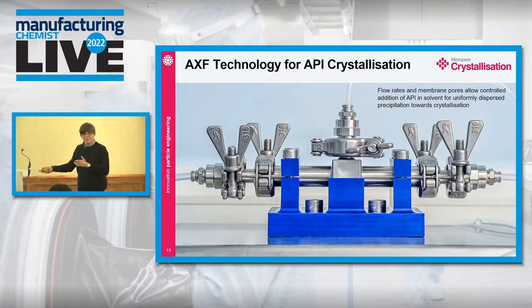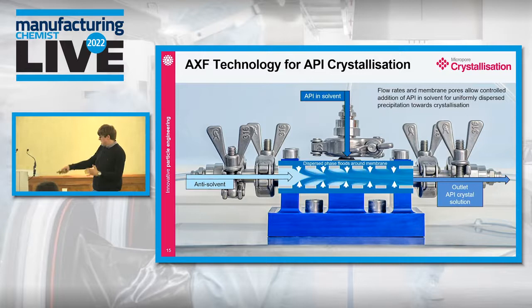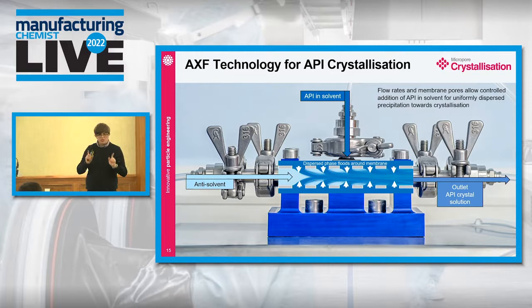Okay. Now, normally what we do is the API in solvent would come through the vertical inlet. The flow rates here for an AXF1 are normally controlled via gear pumps. For the smaller equipment, the AXF Mini I mentioned earlier, that can be done with just syringe pumps. Whereas here, your API in solvent is controlled via the vertical point, your anti-solvent is controlled via the horizontal point, and this is essentially how they intermix. API in solvent is injected through the pores and mixes with the anti-solvent. The introduction is controlled through the pores, through the flow rate, to control the micro-mixing in order to get the outcome that you desire.